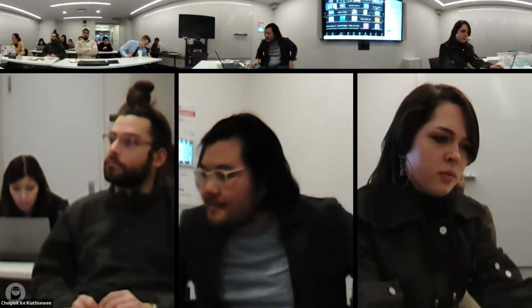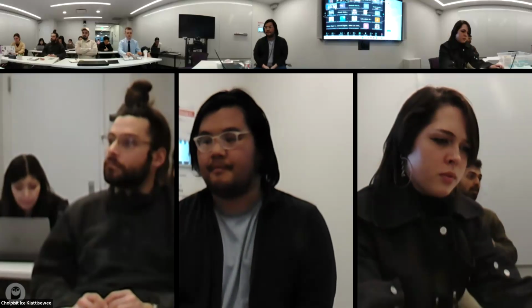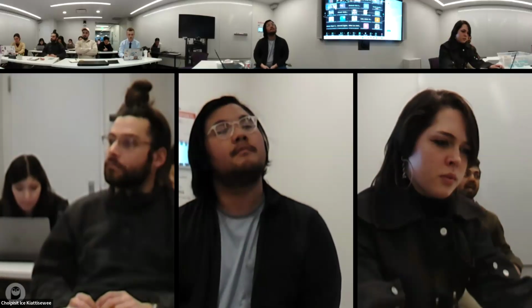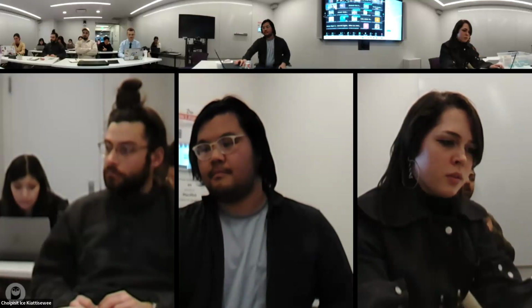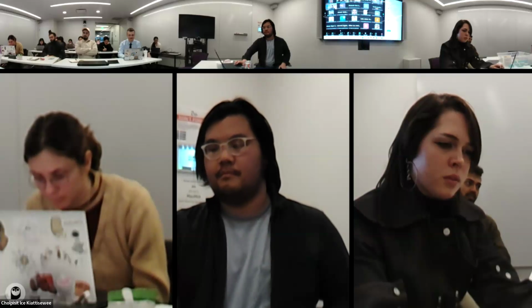Again, four things: promoter, RBS, coding sequence, terminator. You need all of those. Let me add something else to this. I want to see a diagram of people drawing this out, showing where your terminator is and where everything is in your map, either as an annotation on Benchling, or just written down on the paper you have. Use the naming and labeling scheme from the symbols on one of the slides that was shown. Please keep it as straightforward and standard as possible, because it makes our job easier in knowing how far you are and what you need help with.